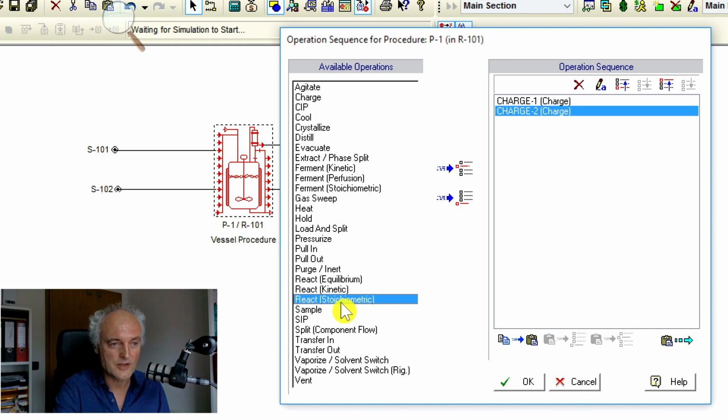We just go stoichiometric. Stoichiometric just means you give the stoichiometry, you tell the software, go to 80% or whatsoever, and everything is fine. Kinetic, you need to give the corresponding equations and so on. So this sounds complicated. You don't do that in setting up processes. You don't use kinetic operations if you don't need to. Let's say an internship we had at our department was for SuperPro and a wastewater treatment plant. There you need to do a kinetic simulation, but in a general process like this, you don't do that. You just use a stoichiometric.